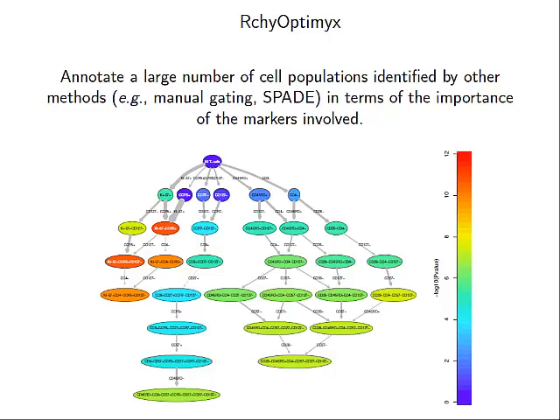All right, so let's look at that transition from the blue population above it, which is CCR5. Then we add Ki67, and the significance and the ability to distinguish between the two states has increased a lot. Okay, and that's the thickness of the arrow. Yeah. We use these thicknesses to find the best path. In finding the best path, you want to look for big changes early to get all those best paths through the data set.